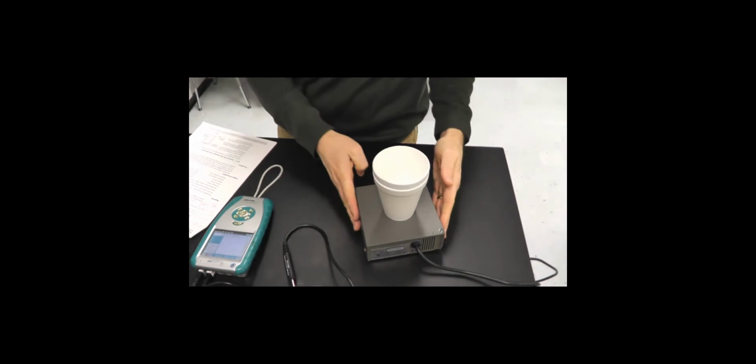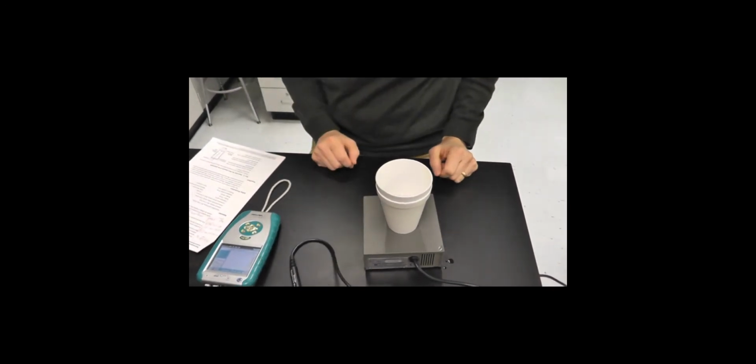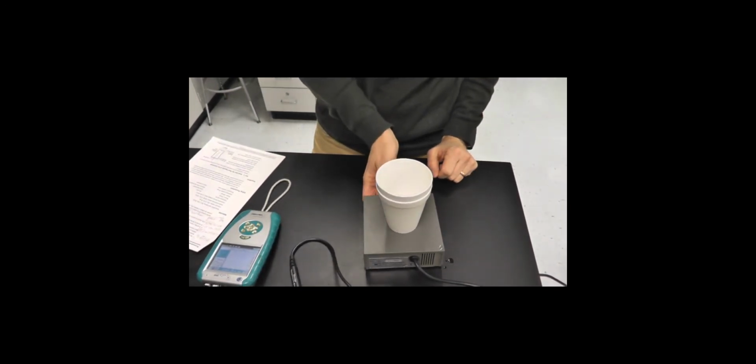If you look at the procedure, there are, I think, five pre-lab questions, which are on the bottom and then up here. So make sure you do the pre-lab questions. But if you look at the procedure, set up a calorimeter of two nested styrofoam cups. I've got two nested styrofoam cups, and there's actually a magnetic stir bar in there, so we can stir a liquid. So we're stirring it as we are taking a temperature.